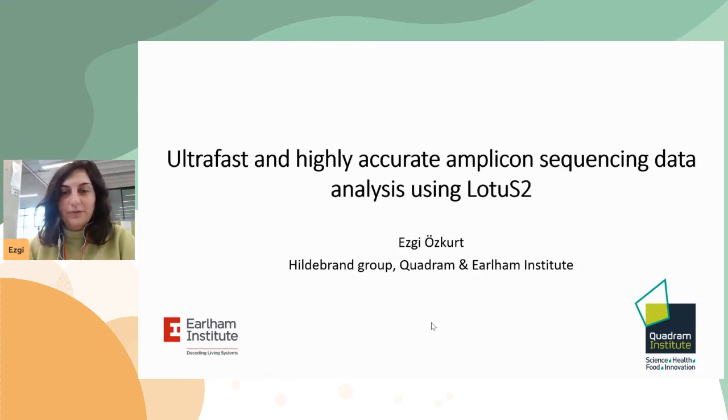I'm working as a postdoc in the Quadram and Earlham Institutes, and I'm interested in increasing the resolution of microbiome profiling using both dry and wet lab techniques. And today I'm going to present to you our amplicon sequencing data analysis pipeline, LotuS2.